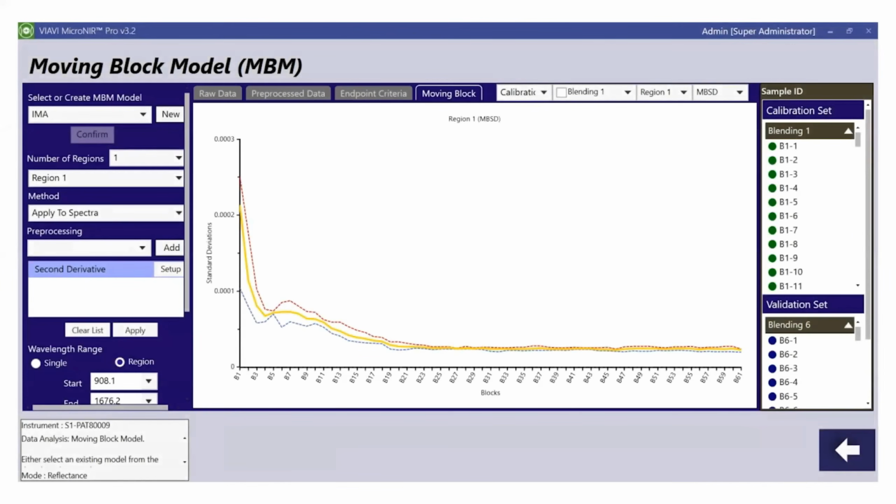In the graph, the Golden Batch is displayed with a yellow line. The minimum is a dashed blue line. The maximum is a dashed red line. In this way, you can keep your process under control in a very simple way. You just need to look at where your profile is lying. If there is an overlap with the Golden Batch, it is fine, but if you see that you are going out of one of the two dashed borders, it means that there is a red flag that needs to be investigated in the laboratory.